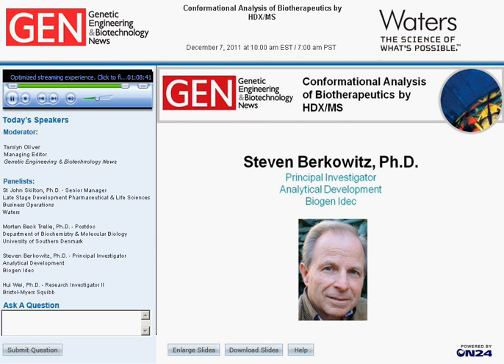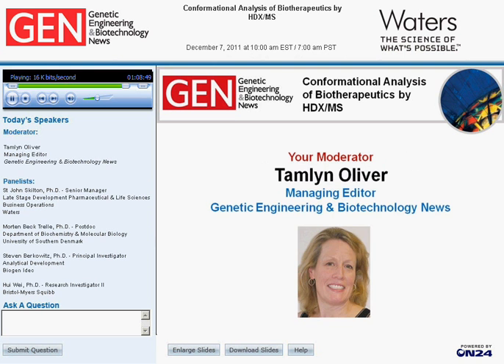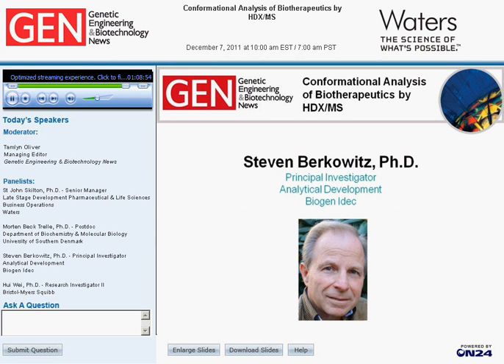All right. Are we expecting to see the use of HDX by biosimilar manufacturers? I really think that's going to be a reality as things progress. This technique offers a level of comparison that you'd have to go to something like X-ray diffraction or NMR for, and there are obviously problems with those types of techniques from a biophysical standpoint. So I think deuterium exchange mass spectrometry gives an opportunity to really look at the overall structure at a high coverage and actually make that comparison to assess the comparability in terms of the higher order structure.